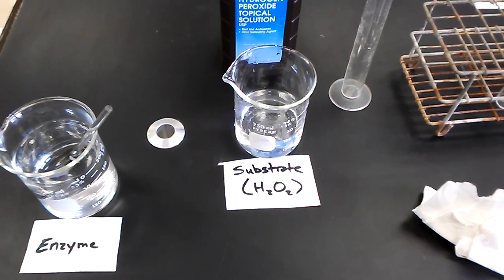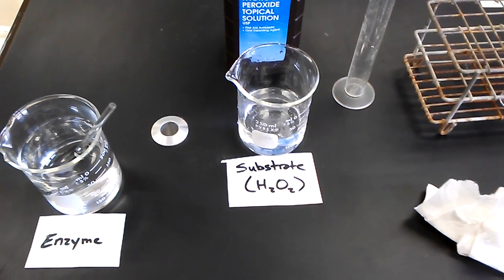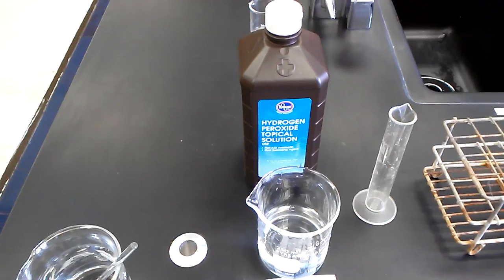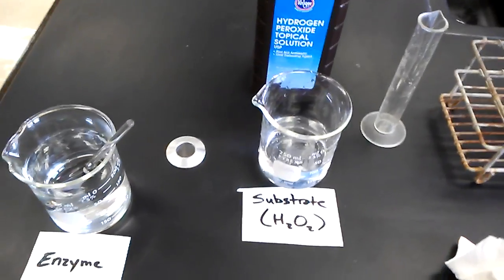In the beaker centered is hydrogen peroxide, which is the substrate for this chemical reaction. It's the same hydrogen peroxide you can buy at the grocery store. This is 3% hydrogen peroxide.